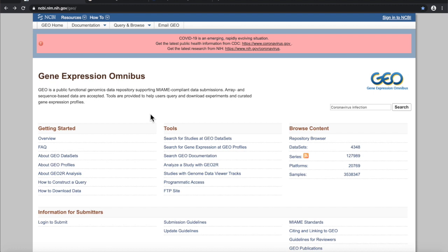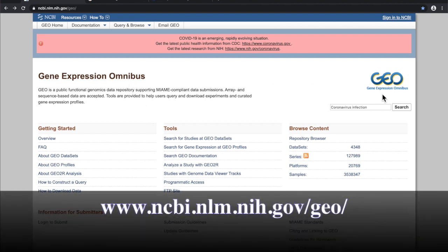This video is part two of a series I'm doing on crowdsourcing coronavirus data. In this section, we will go over collecting the data used in this meta-analysis and preview some of the tools used to gather this information. I am starting out by showing you the screenshot of the website Gene Expression Omnibus, or GEO for short.